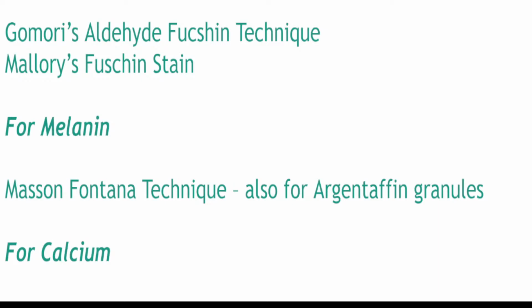For lipofuscin, again, you'll hear Gomori's test, but don't be confused. Most of the time, they will ask that. For melanin, do not forget argentaffinoma cells. For melanin, you want to demonstrate argentaffin cells. This was asked in a board exam before, and the test is Masson-Fontana technique. We want to look for argentaffin cells.